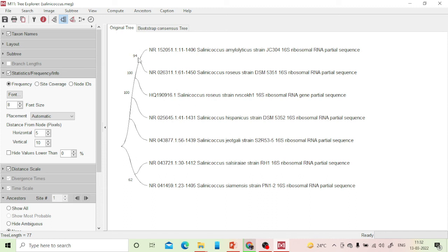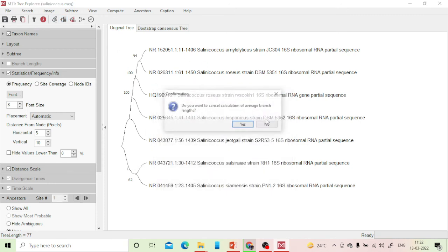The tree is now available. Bootstrap values are 94, 100, and 100 for most branches — one branch shows 62. If bootstrap value is more than 80, you can be confident the phylogenetic result is correct. If it is below 80, recruit more sequences to reach a valid conclusion.